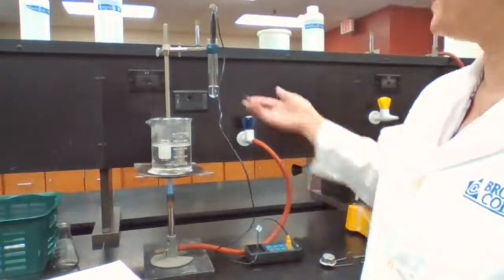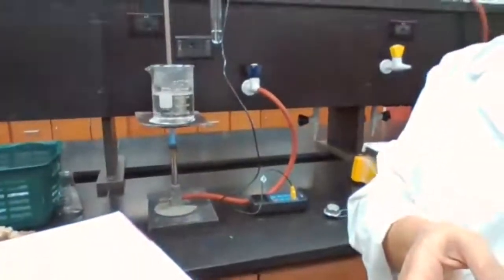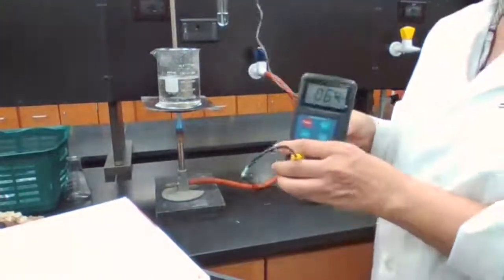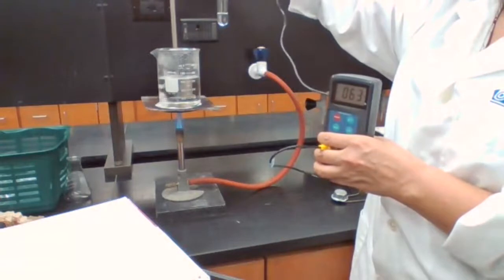Right now it's 65. It still is liquid. It's too early, but I'm going to show you step by step what is happening. So I have the temperature still at 63, and the sample is liquid.